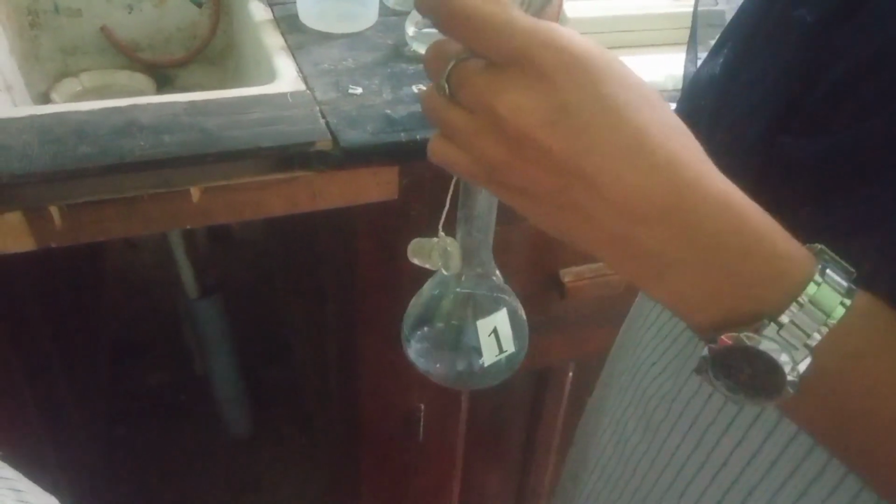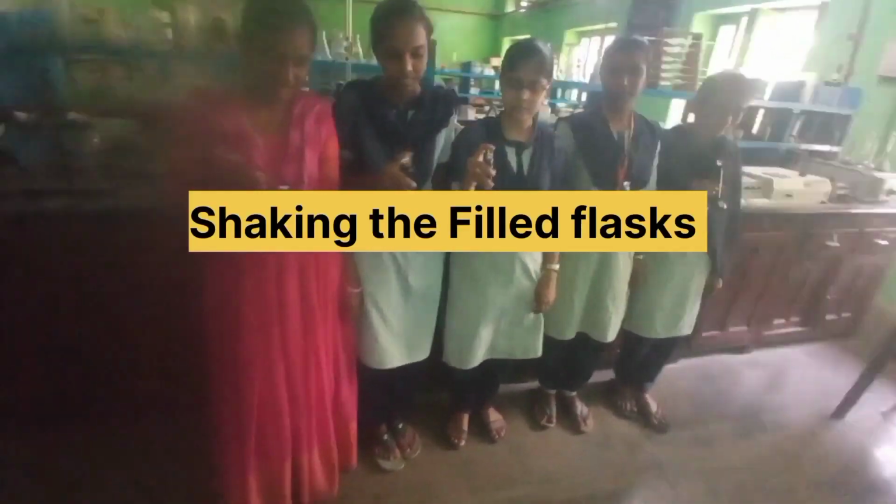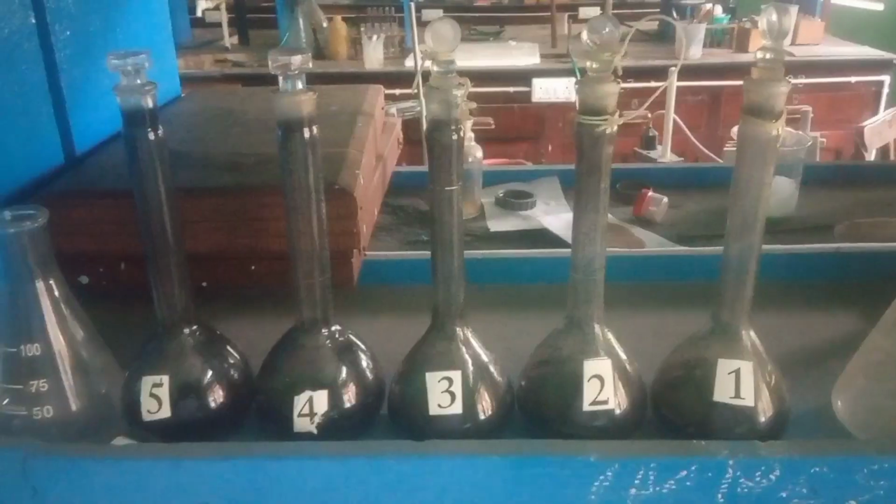Here, standard addition means if the first flask is taken with 0.5 grams of charcoal, the second flask is to be taken with 1 gram of charcoal, third one 1.5 grams, fourth one 2 grams, fifth one 2.5 grams, like that. If we take, that is said to be standard addition method.